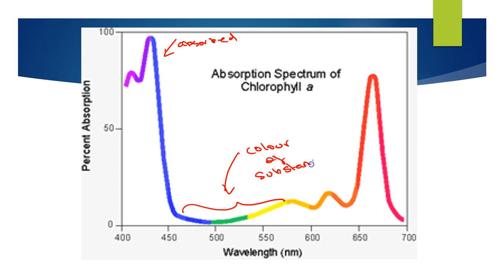Okay, so if I wanted to do an analysis in order to detect chlorophyll, I'm going to select a wavelength that would give me a high absorbance because that will make it more sensitive. So I could either go in the blue-purple range, or I could take a nice absorbance around 660 nanometers, and then this will allow me to detect how much of that light is being absorbed, which would be proportional to the amount of substance that I have in my cuvette.